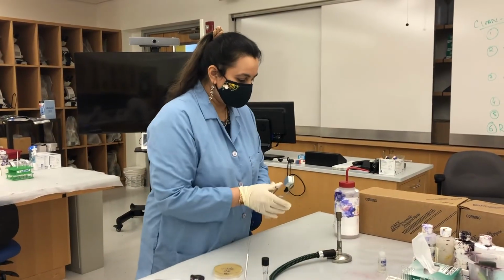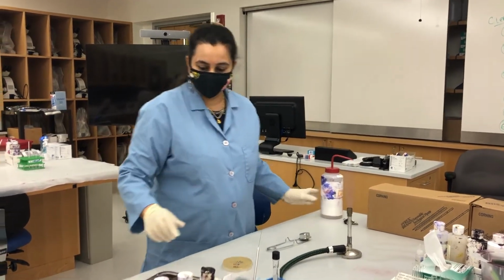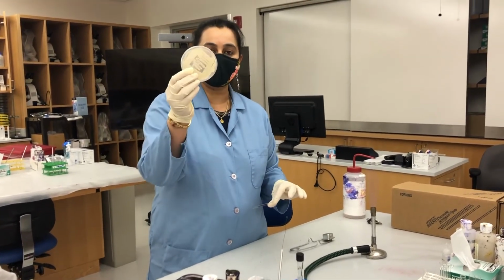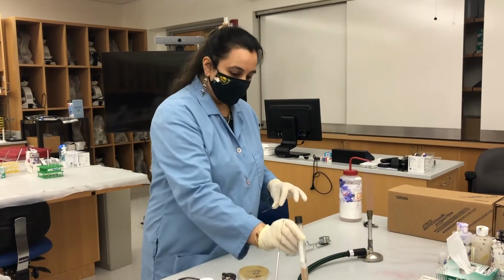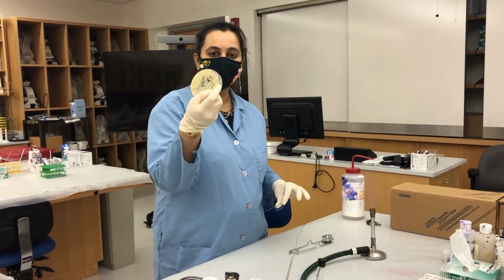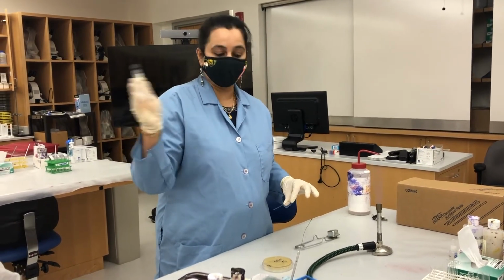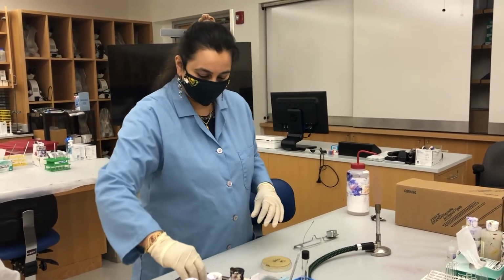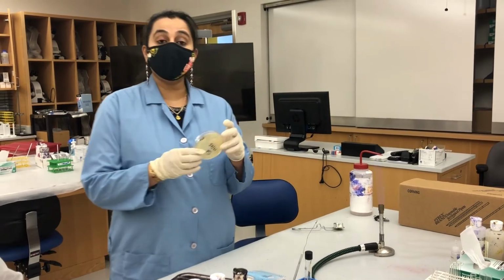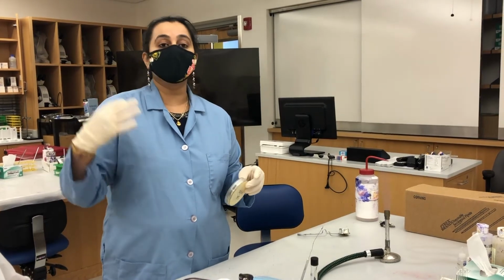Okay, let's just light the Bunsen burner. We have the flame going and we are ready to make the bacterial smear. So today I'm going to show you how to make the bacterial smear using the solid culture as well as the liquid culture. I have gram positive bacteria, Staphylococcus aureus, on the plate here, and gram negative bacteria, Serratia marcescens, as a liquid form. The goal is to add enough cells on the slide, on the microscopic slide, so that we can stain it and look those cells under the microscope.